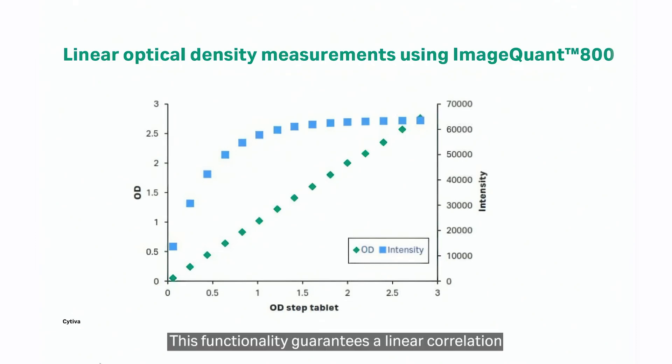This functionality guarantees a linear correlation between sample amount and signal intensity.